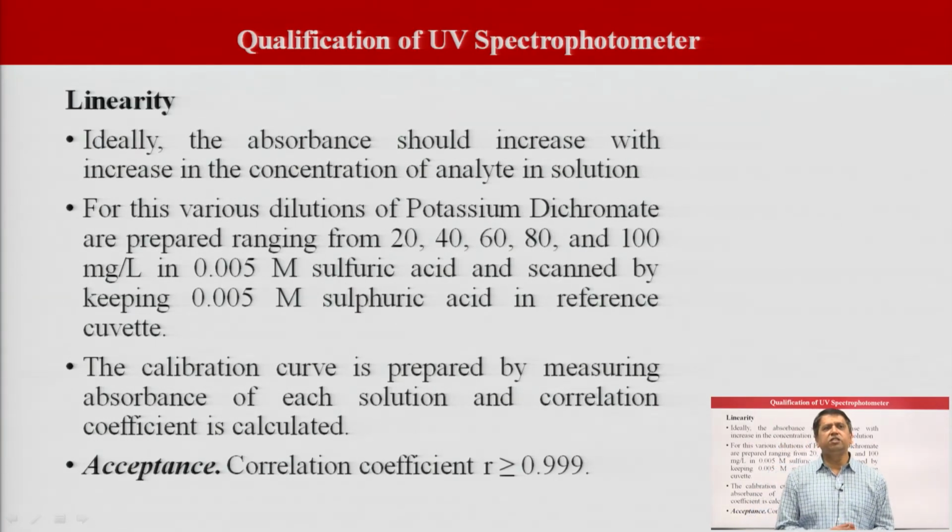The next test in the operational qualification is linearity. Ideally, the absorbance should increase with the increase in the concentration of analyte in solution. You can easily understand, if the concentration of the analyte is more, the absorbance also should be more.